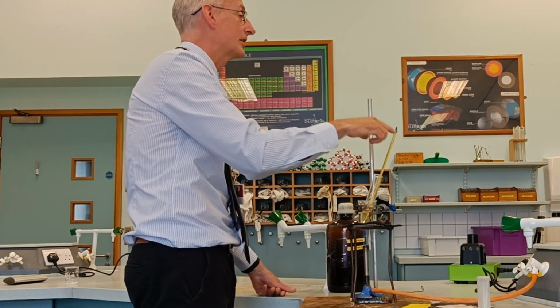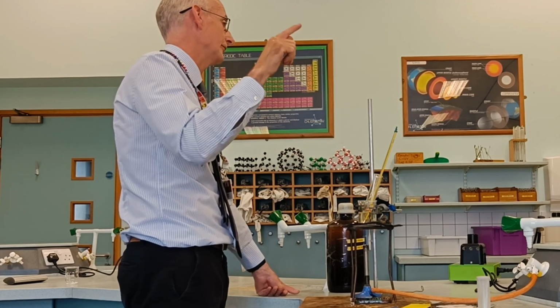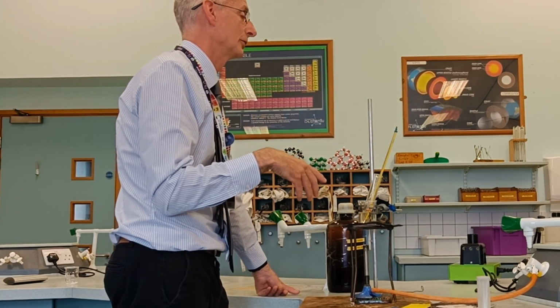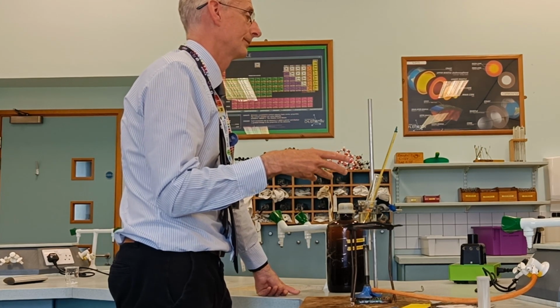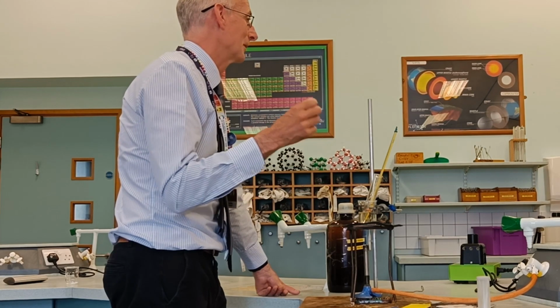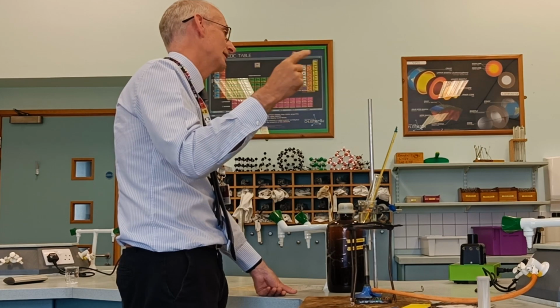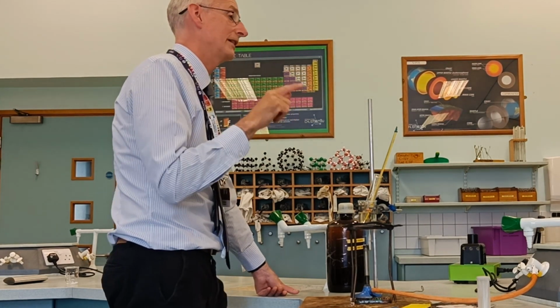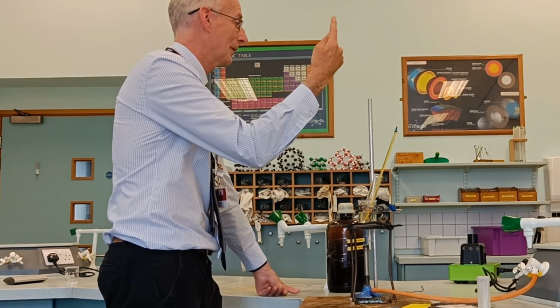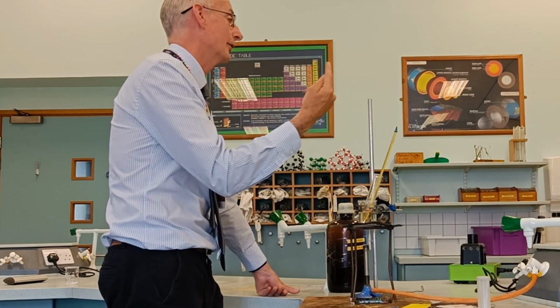Okay. Now you can only spot the melting when you're going from solid to liquid. If I let the whole thing cool, what's going to happen? Your sample. It was a liquid, you're cooling it down, what's going to happen? Solidifies. It's much harder to spot the change of going from liquid to solid. So this is a one shot, we only get one chance at this. Okay? You can only measure the melting point on the way up. Yeah? You can't think, oh, I missed it, I'll let it cool back down again, and then go again.